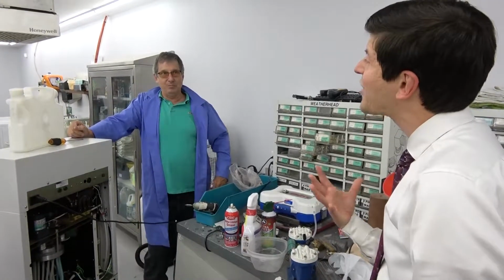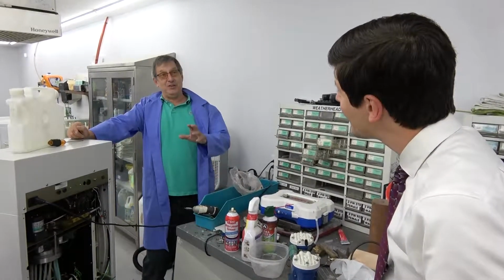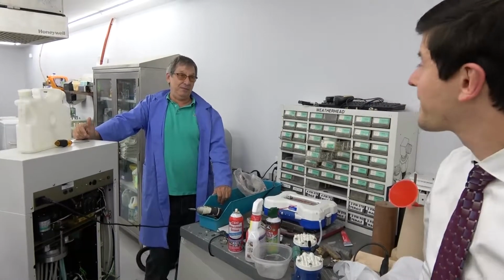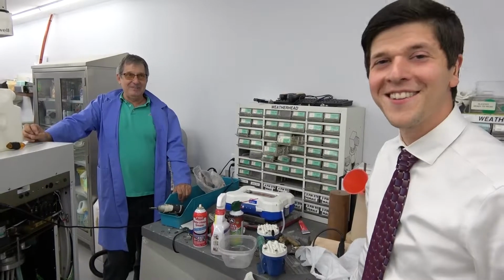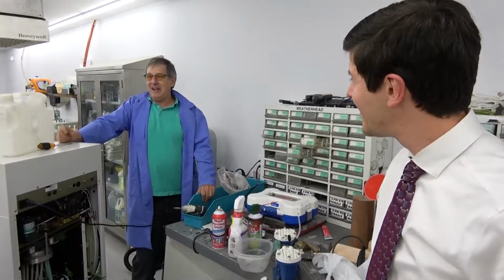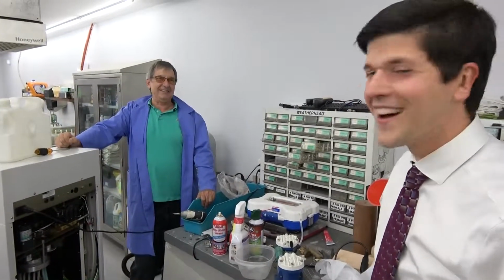So why not just microwave your wax and then dump in molten wax? Well, they do have devices for that. We have machines that will actually microwave, like Milestone. If they really like the idea of microwaves, we can take care of it. I just invented a new machine. But it's already been invented. Handling hot molten wax is not something I like to do. It has disadvantages, that's true.